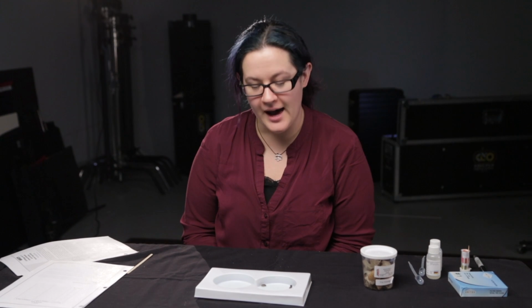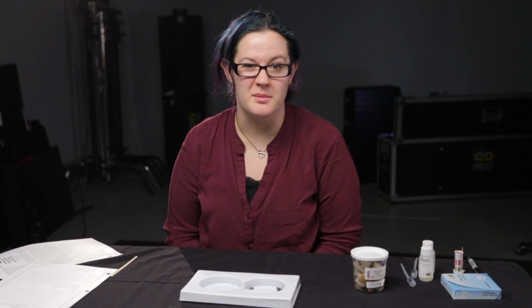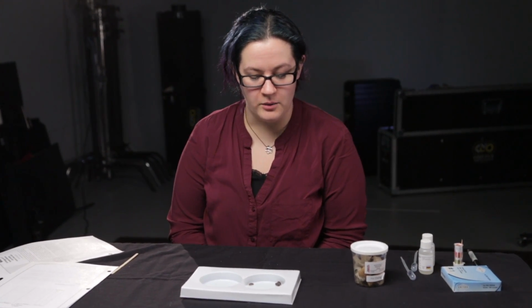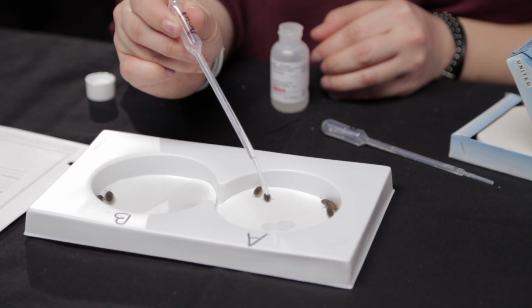Hi, this is Ms. Hollenbach, and today we are going to be doing a lab experiment on animal behavior. I have with me today 10 isopods, or 10 pill bugs. You might know these as the roly-poly guys that you can sometimes find in the garden. And what we are going to be observing is their behavior before and after a stimulus.